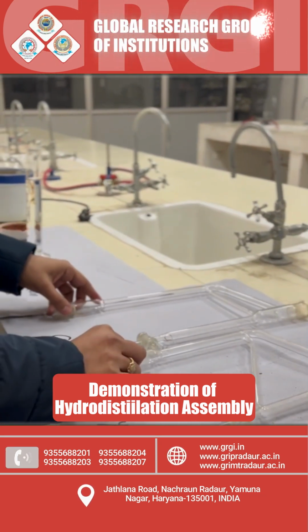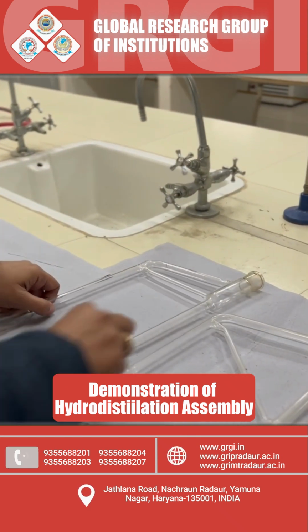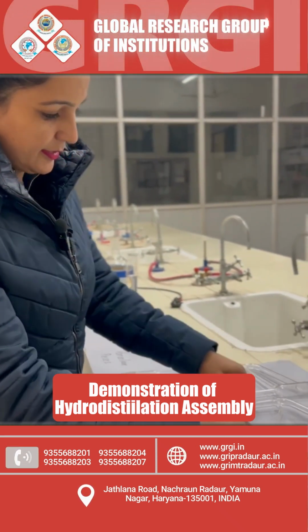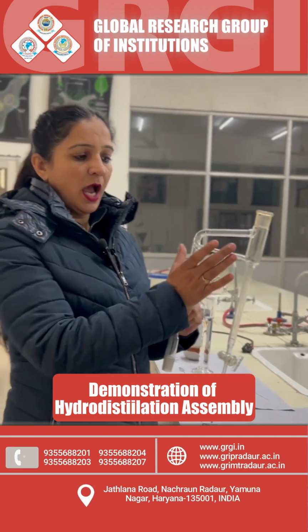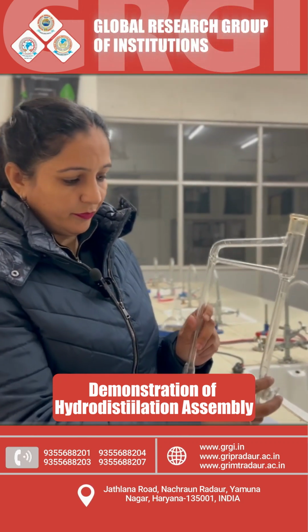Next part, and the main part of this assembly, is the clevenger assembly. You can see here the clevenger assembly is of two types. First one is this H-shape assembly and the second type is this N-shape assembly. The H-shape assembly is used for the isolation of volatile oils which are heavier than water.